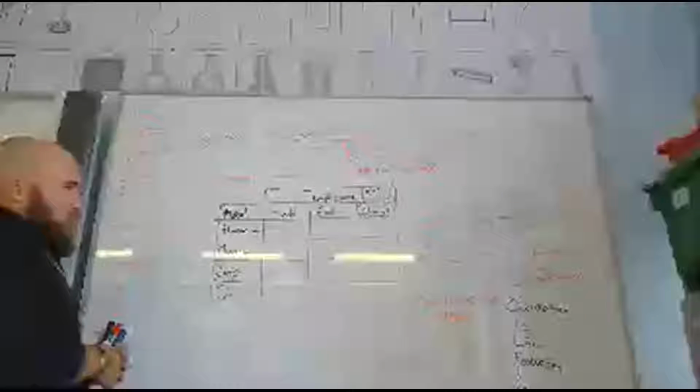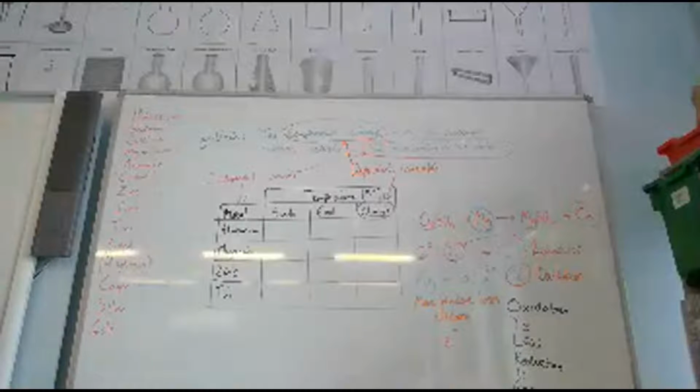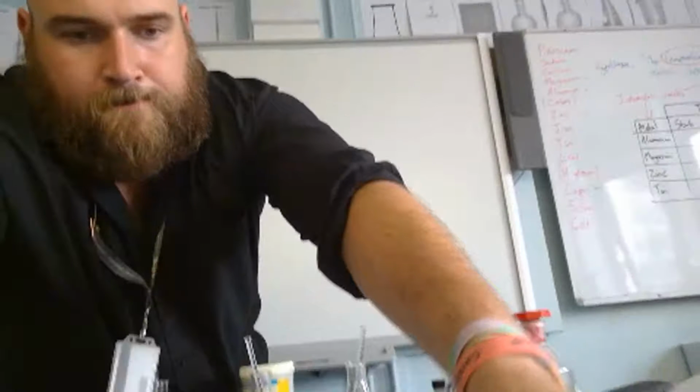So let's have a look at the actual reaction then. So we're changing the metal, we're measuring a temperature change. So again, let's have a look at the actual practical, and I'll see if you guys can make a list of, think about what things we're going to keep the same.